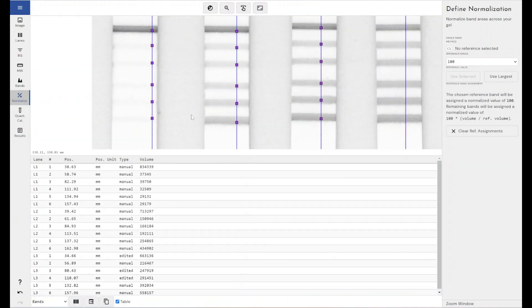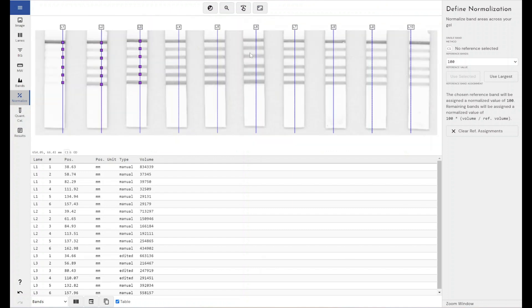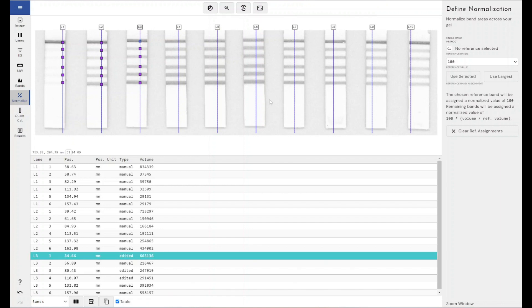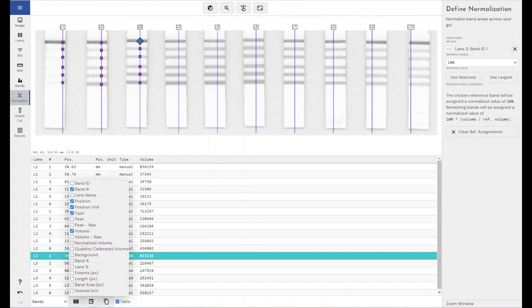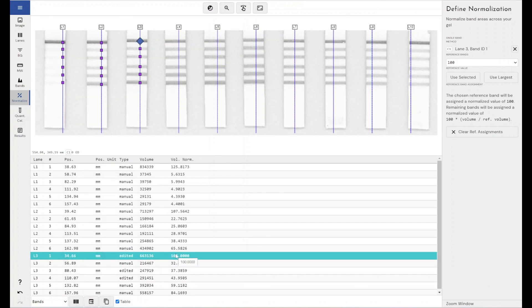I'm just going to move along from this workflow mode, but you get the gist of how I would find all of my bands within Phoretix 1D. Normalization, again, depends on your experimental setup. If you wanted to express all of your bands as a percentage of your control band, you may wish to set your control band as your 100% mark and see what proportion the rest of these bands make up towards that control band.